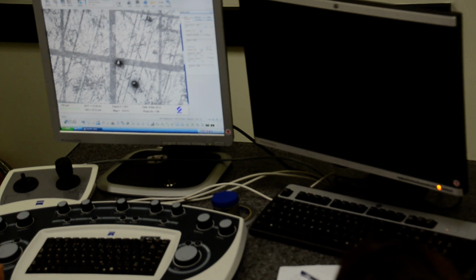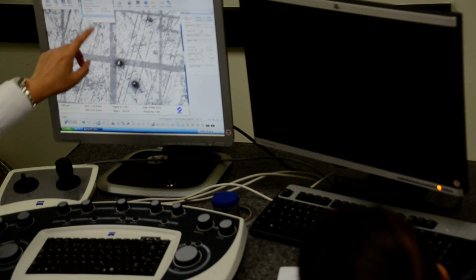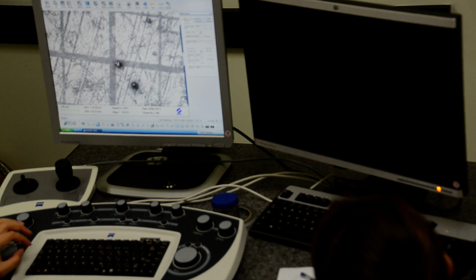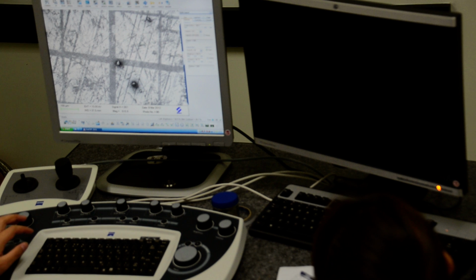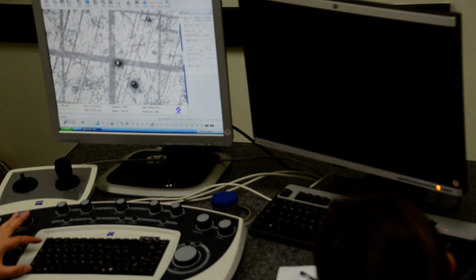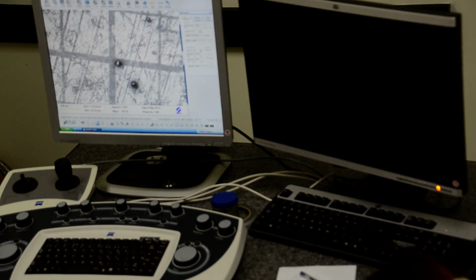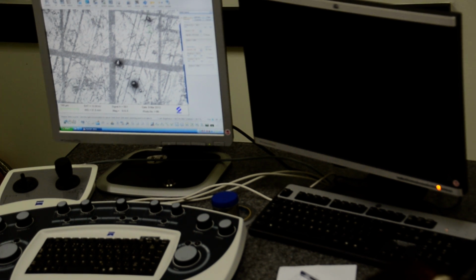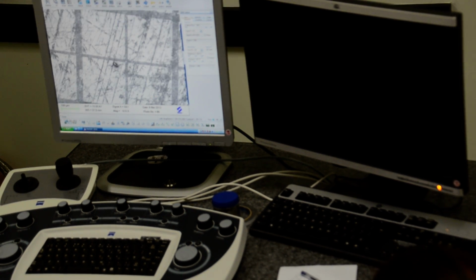And here, we still see again these two functions. Forget about it, but you have to know how to get a sample, let's say this particle, to the center of the screen. You use Control plus Tab. Just click once until there's a green marker, a green cross, coming up on the screen. Then you just use your mouse left click, and you bring it back to the center.